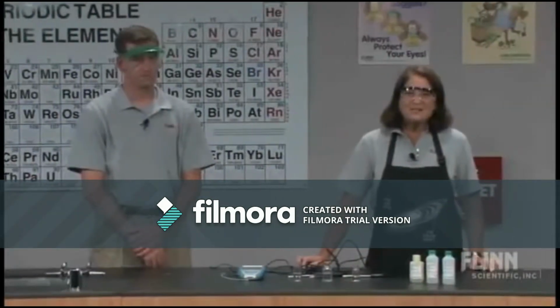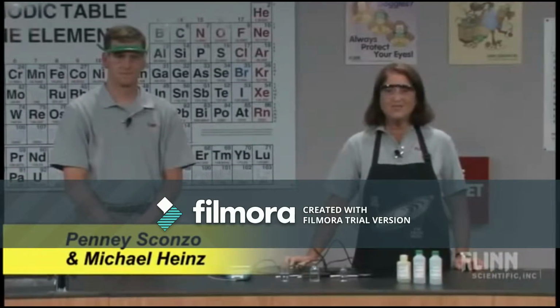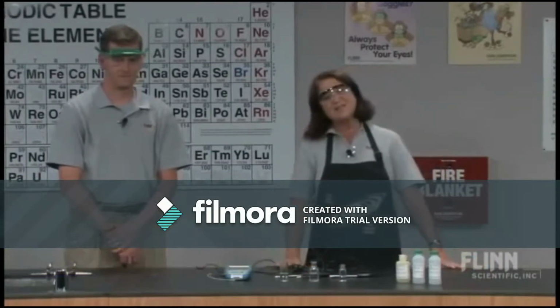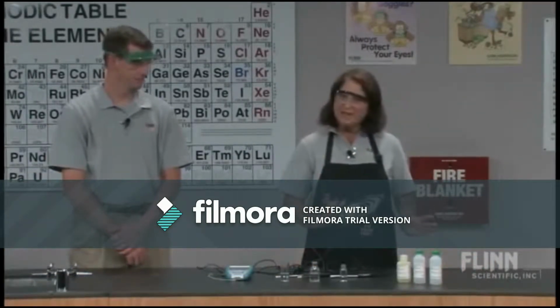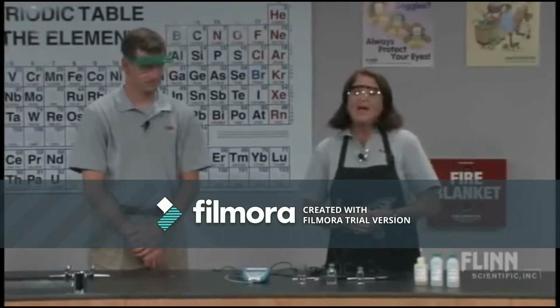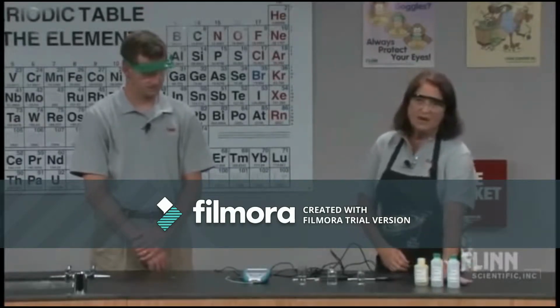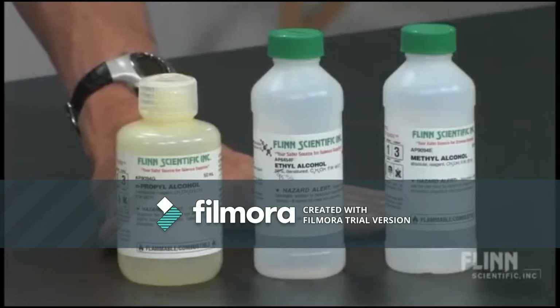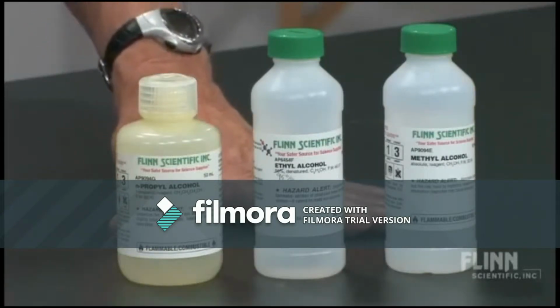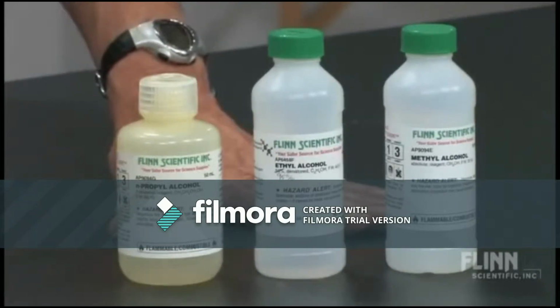One of my favorite experiments in the lab is called evaporation and intermolecular forces of attraction. I have my students do this, collecting a lot of data points very quickly by using technology. I'm going to start today by using 3 different alcohols. The alcohols are sitting here. They are methyl alcohol, methanol, ethyl alcohol, ethanol, and n-propyl alcohol.